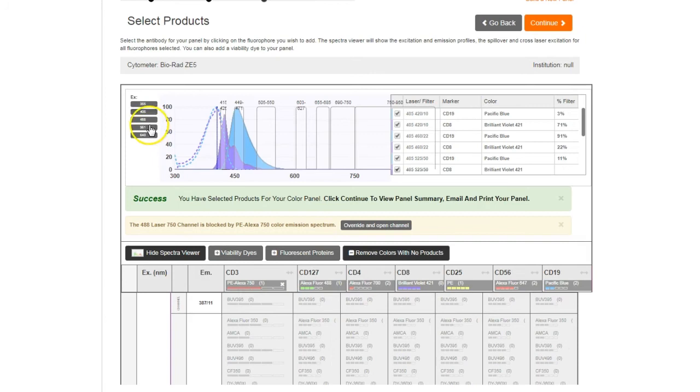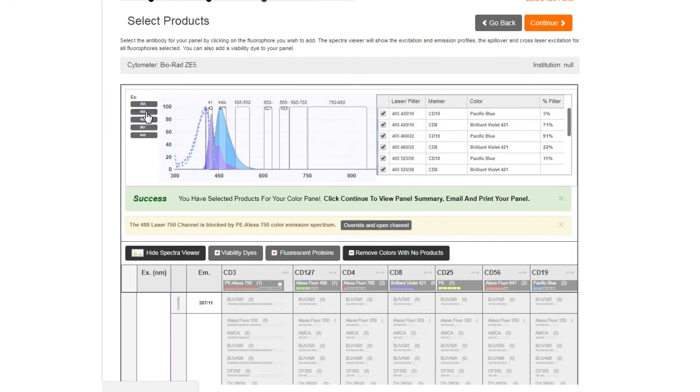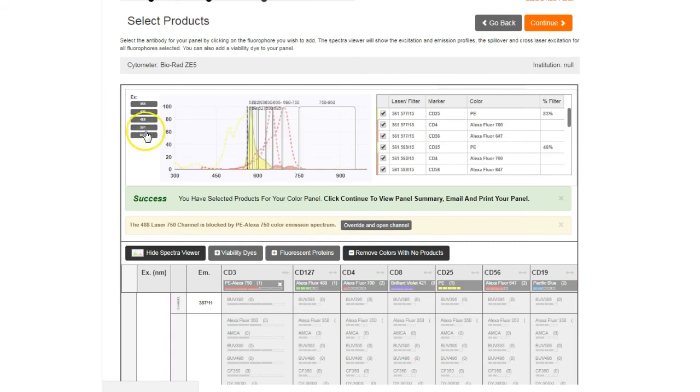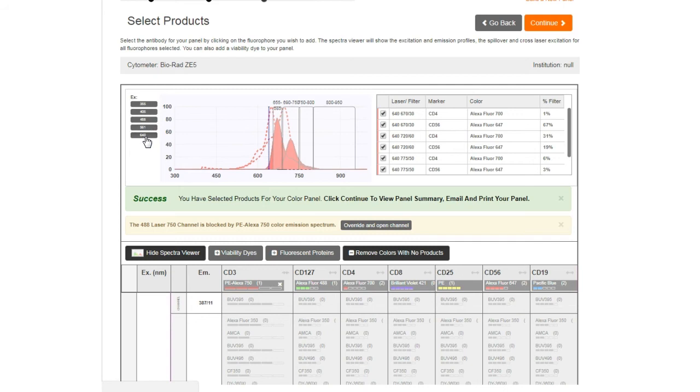The spectra viewer shows you the excitation and emission wavelengths, spillover, and any cross-laser excitation. This will give you an idea of any compensation that you might be required to perform.